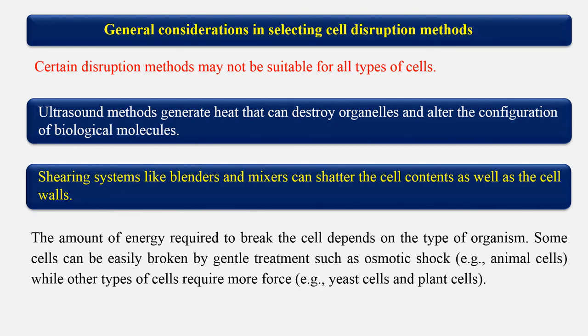Certain disruption methods may not be suitable for all types of cells.